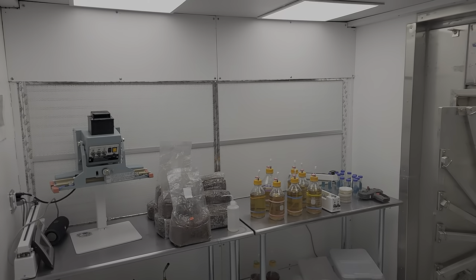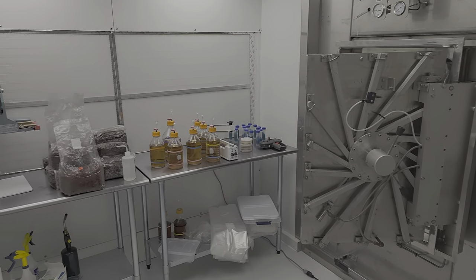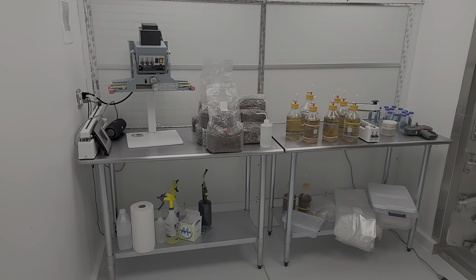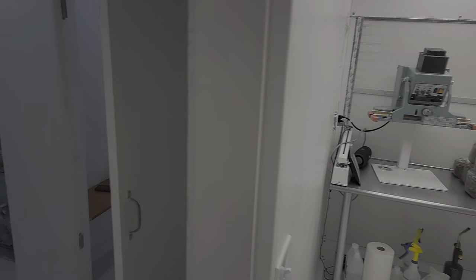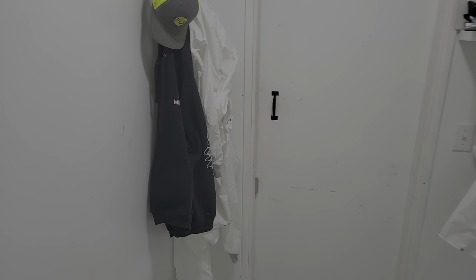Welcome. This video is about my spawn lab, my culture lab. I wanted to show you basically everything that I put into it design-wise. This is the gowning room, which is a critical part of a clean room — having a room where you can transition from outside clothes to being in the clean room.